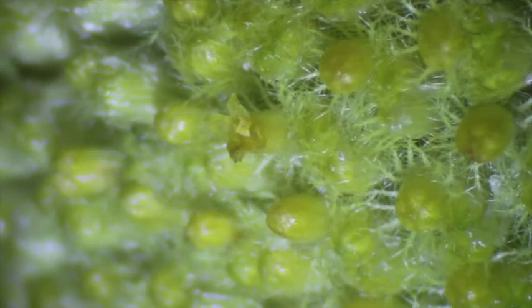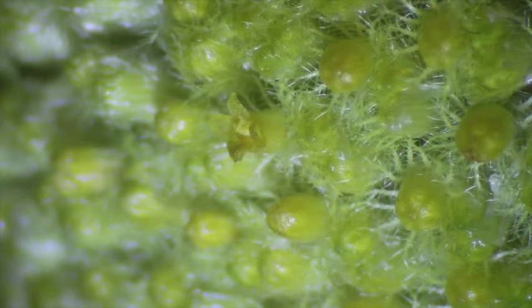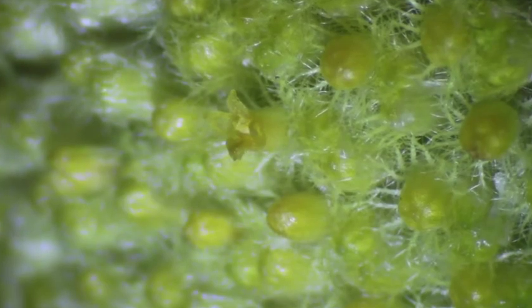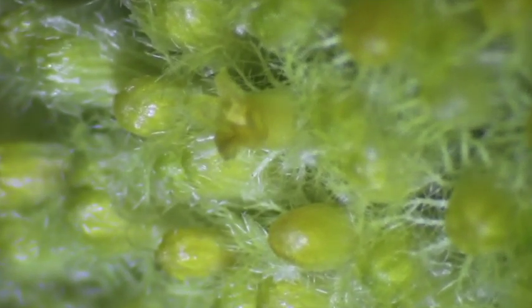Okay, so I was over at the store and I just thought I would get this Craspedia because it looked really cool. I wanted to check it out underneath the dissecting scope. But when you look at a lot of these plants like sunflowers and composites, all of those little teeny tiny things in the middle are actually the flowers. And the flowers have full petals and everything on the inside of those guys. Okay, so this is Craspedia, and all of these little things then are individual flowers.